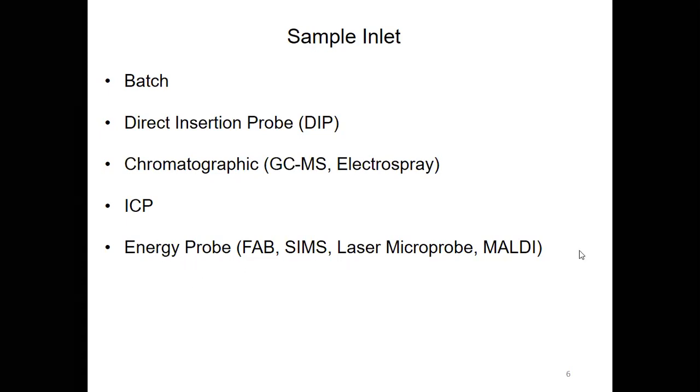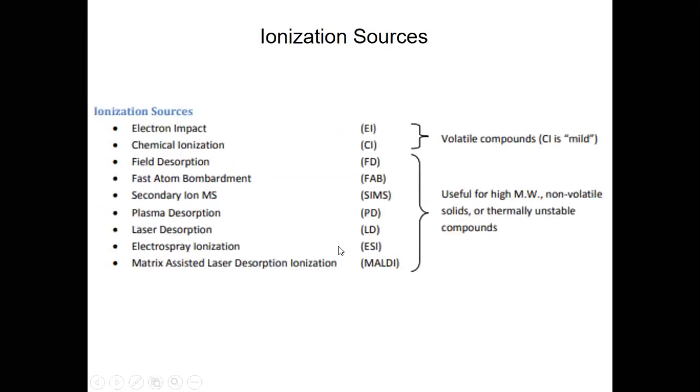These are examples of sample inlets, and I will discuss them briefly later. Before that, I will go through the examples of the ionization sources.